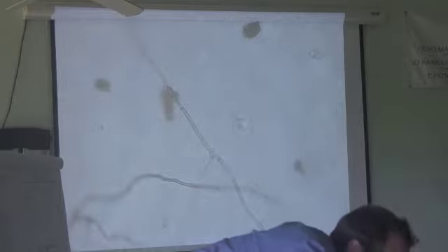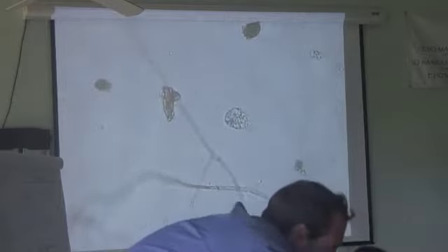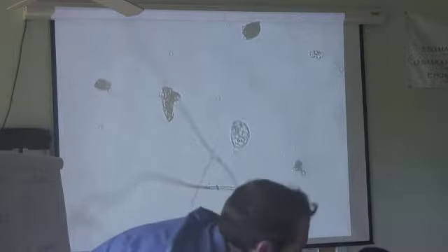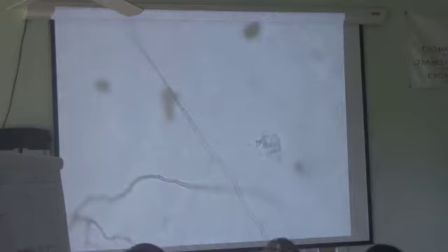But this is a great demonstration of cilia. Yeah, just going round and round. See, he's eating 10,000 bacteria today in order to stay alive. See all the little grainy things inside of him? And he just pooped. You notice that? He just pooped in. So that little blob right there, he just, yeah. Little plant available nutrient just got released. But you know, count all the bacteria inside. Well, talk about an impossibility.